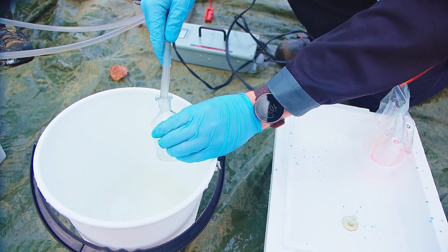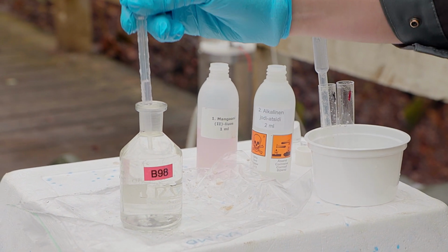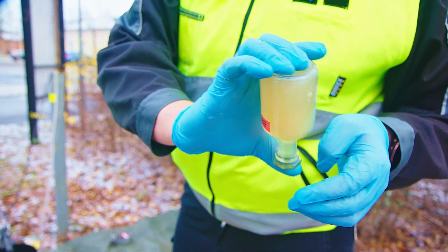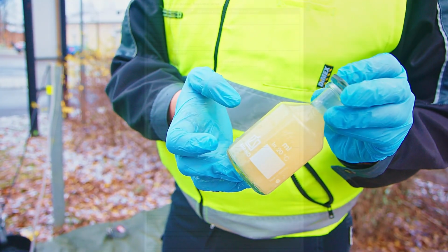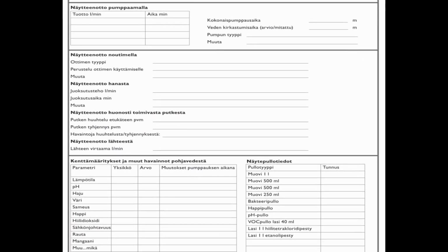The samples should also remain unchanged until the analysis. For this reason, some samples must be fixated. For example, oxygen samples are chemically precipitated immediately after taking them. Some variables also have to be analyzed with field meters as quickly as possible. For example, groundwater temperature cannot be fixated, so it should always be measured in the field.